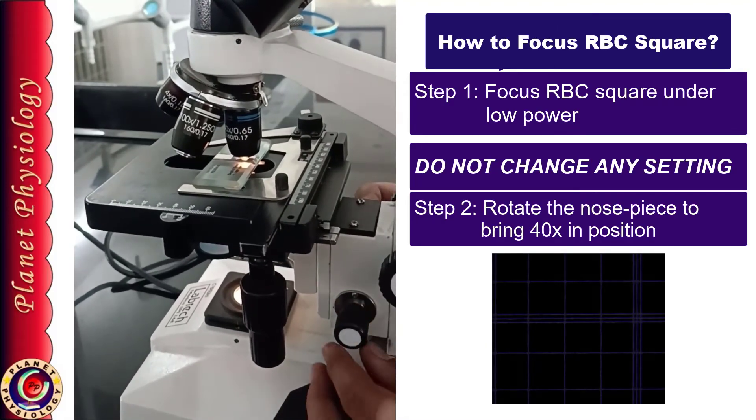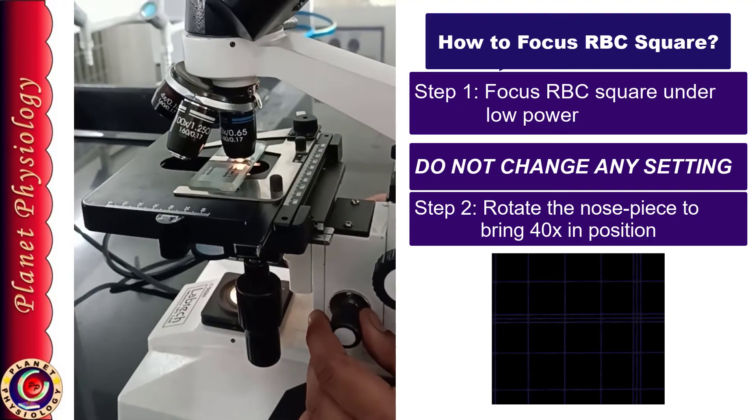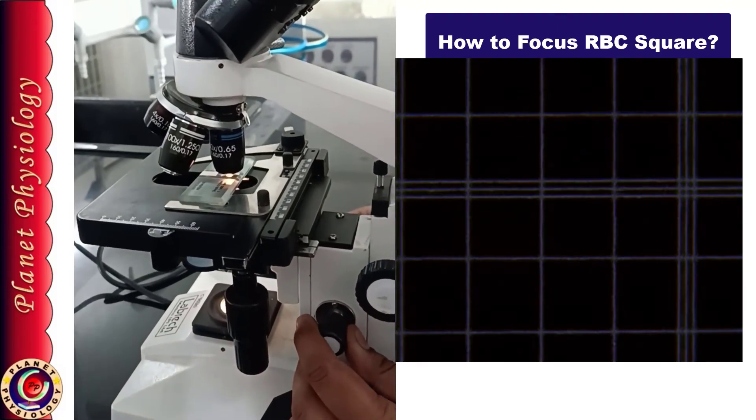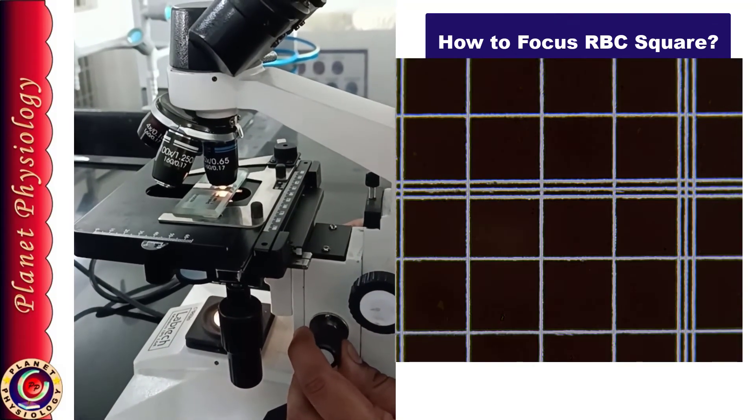So don't bother. Once it is fixed in a proper position, now see through the eyepiece and just do the fine adjustment to bring the grid in clear focus and your job is done.